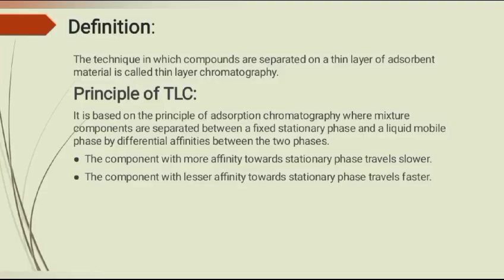We define this technique. The technique in which compounds are separated on a thin layer of adsorbent material is called thin layer chromatography. Principle of thin layer chromatography. It is based on the principle of adsorption chromatography, where mixture components are separated between a fixed stationary phase and a liquid mobile phase. There are two conditions: the components with more affinity towards the stationary phase travel slower, and the components with lesser affinity towards the stationary phase travel faster.